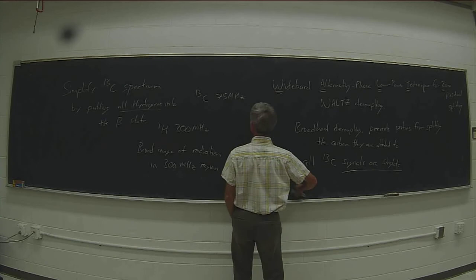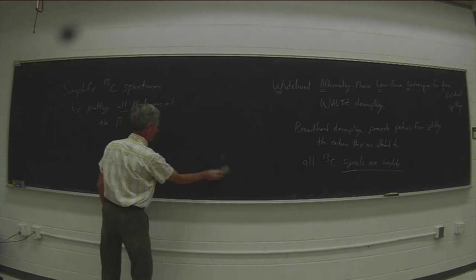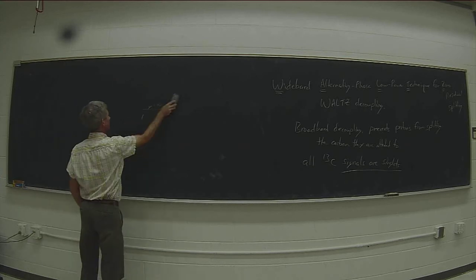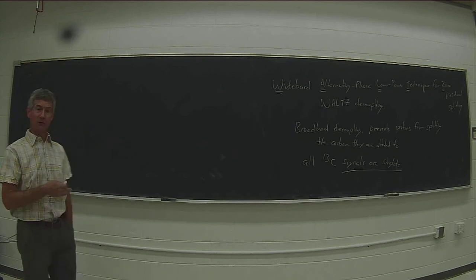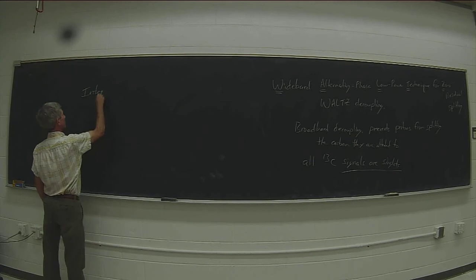We also introduce another complication, which is that when we're doing broadband or WALTZ decoupling, so we're decoupling hydrogens from the carbons, we can no longer integrate.